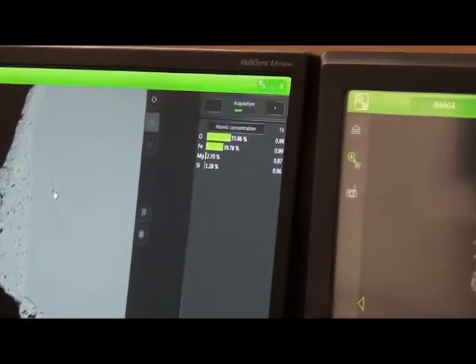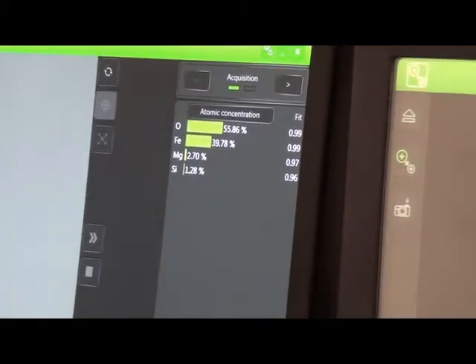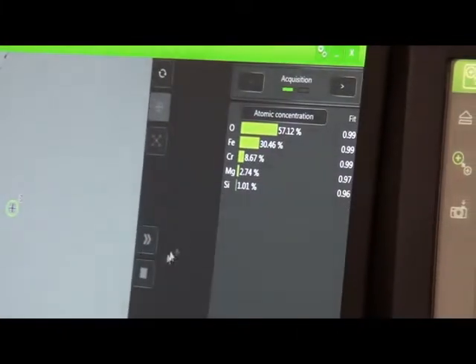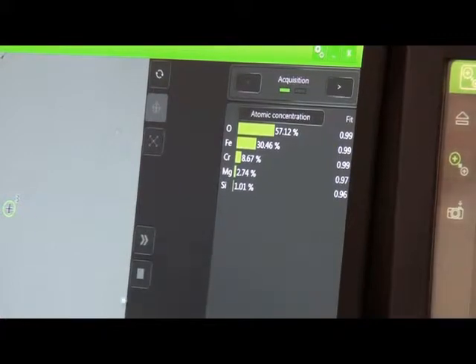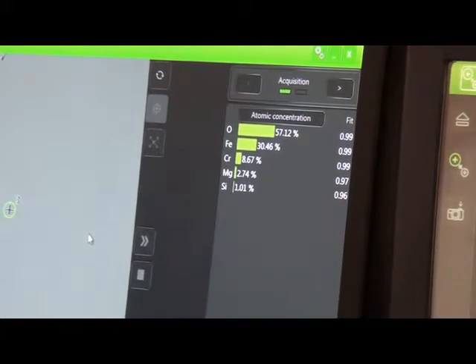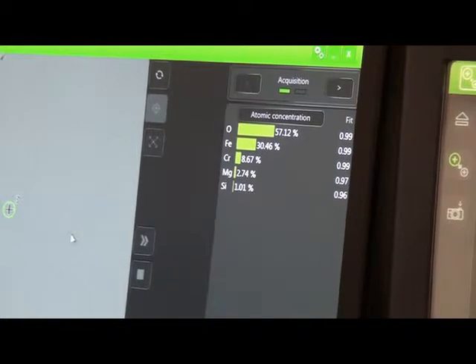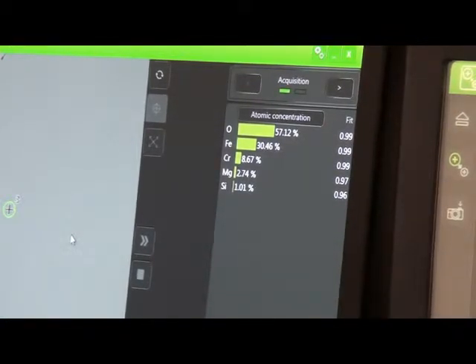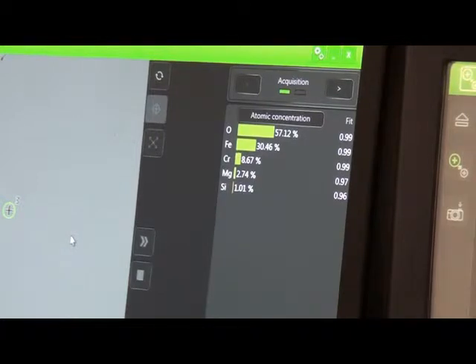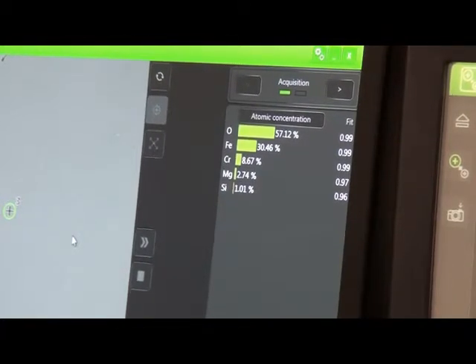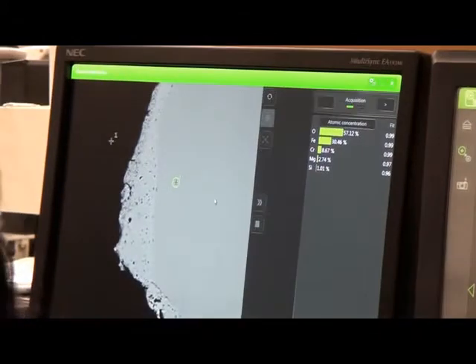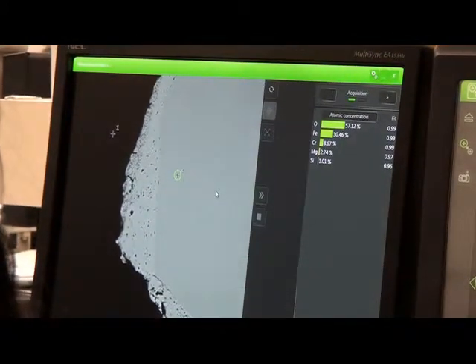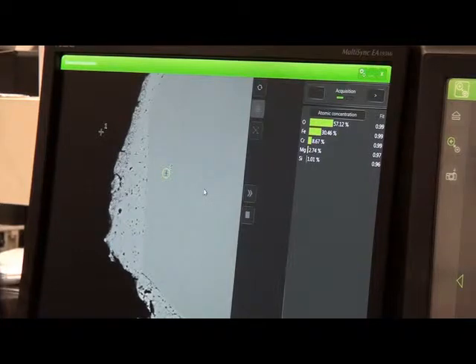Here, we're getting that lots of iron, a little bit of oxygen. And look at number three. There's your chromium again. So this is the phase you initially analyzed. This phase you initially analyzed. And this, because we carefully went in and used the machine and that attribute of the backscatter electron detector that is sensitive in imaging to differences in atomic weight or atomic number to actually show you that there is more than one phase present.